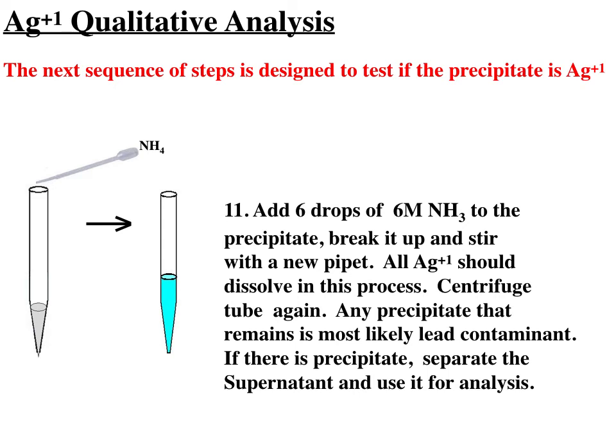Now look, there's a pretty good chance that it does contain silver because that's the only thing that would have been left over. But just in case you didn't completely complex all the lead, and maybe that's just the remaining lead precipitate that would be present. So just to make sure that it is silver present in that precipitate, we're going to reprecipitate it with a different anion selective towards silver.